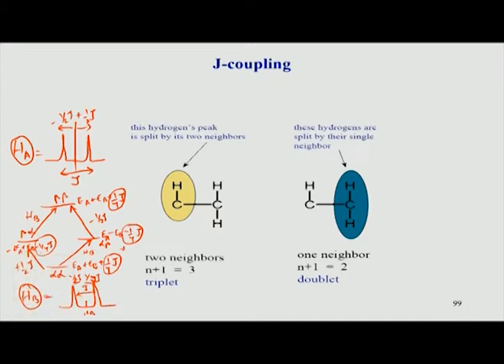J coupling comes basically because of this situation, that the energy levels of A, which was earlier a single peak when there is no coupling, because of the presence of coupling with another spin B, get split into 2 halves. And this is exactly half, in the sense that initially if the signal was 100% here, it becomes 50-50. So, the whole signal has come down by 50% and split into 2 peaks instead of 1 peak. So, this is called a multiplet, and it is called a doublet in this particular case.